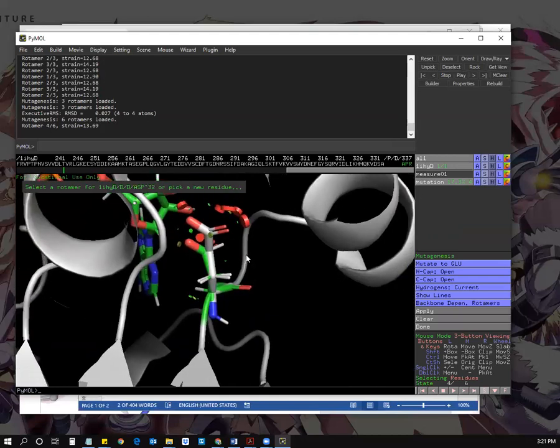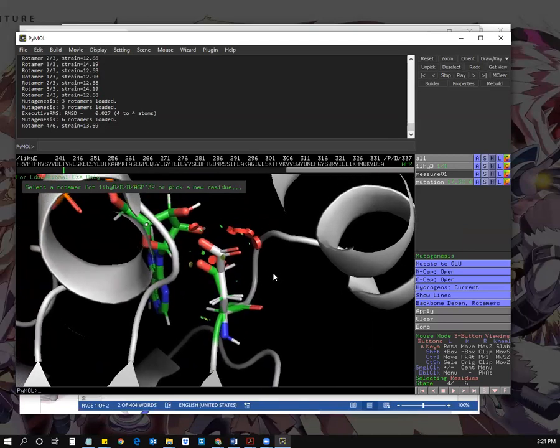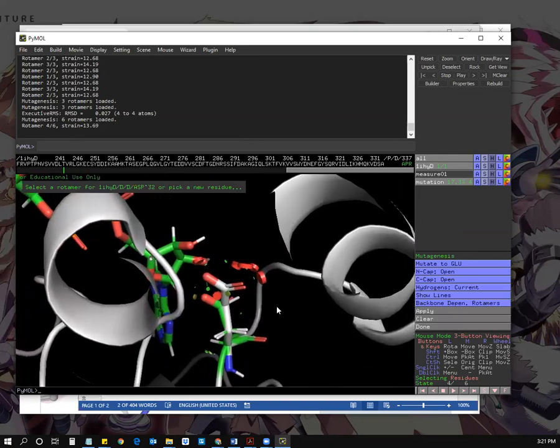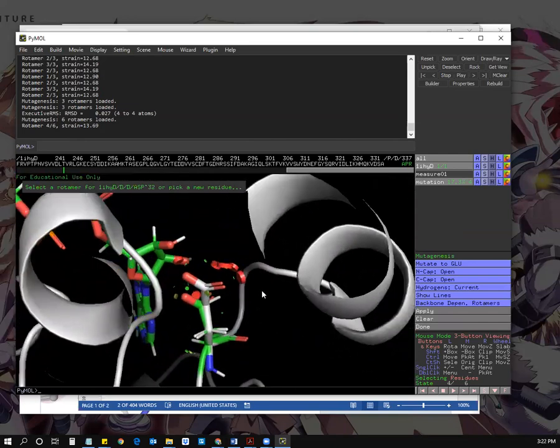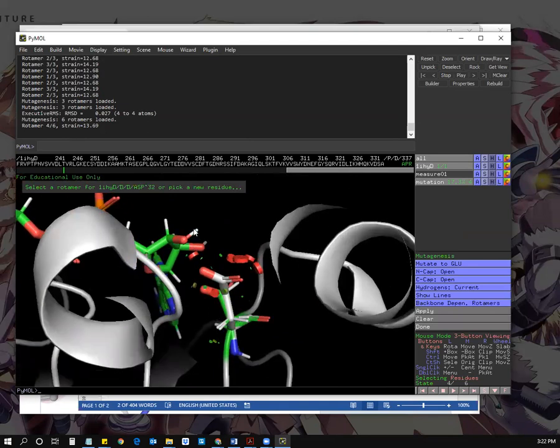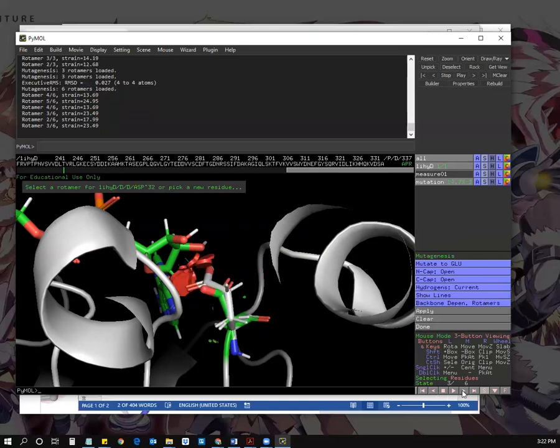If you hold down shift, or maybe control, or I think it's command on Apple, and then drag your mouse, you can also move laterally, horizontally, and vertically. We can see that the new glutamic acid residue is going to be much closer in proximity to that hydroxyl group off of the ribose molecule in this rotamer conformation. If we want to change the rotamer conformation and see if we can get something a little bit closer, that's fine, go for it.